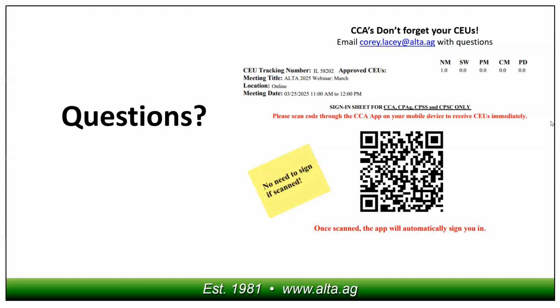But the bottom line is, we did a study, gosh, 15 years ago, where we used 4 different kinds of mills to grind the samples. Then we looked at the particle distribution on screens, and then we looked at the lab analysis. And the bottom line is that the finer you grind it, and I'll say below 1 millimeter, the more homogeneity you get. This is a big hot issue in the carbon market right now, because to get very low measurement uncertainty values, you have to pulverize soil samples down to 0.2 millimeters.